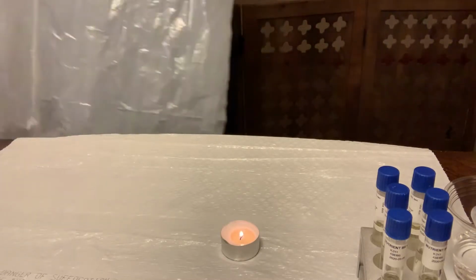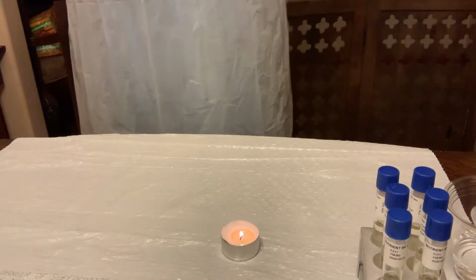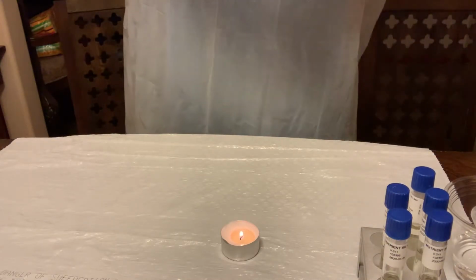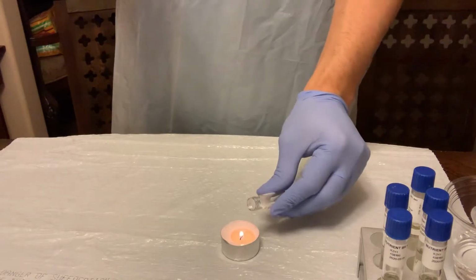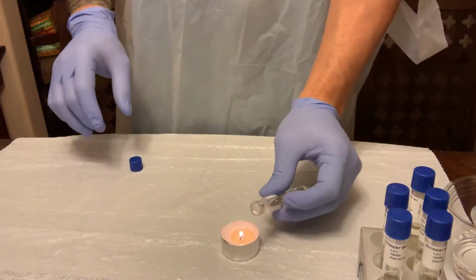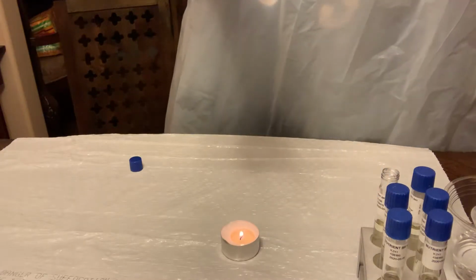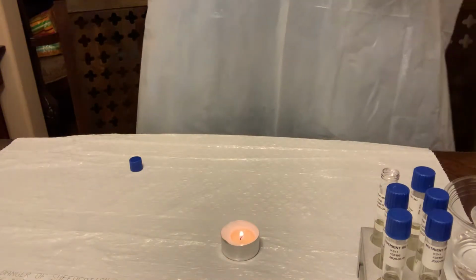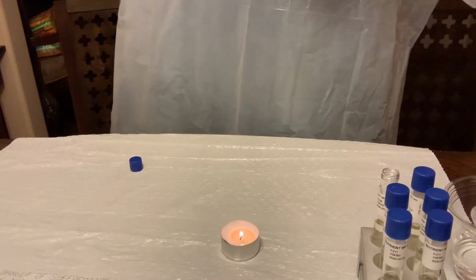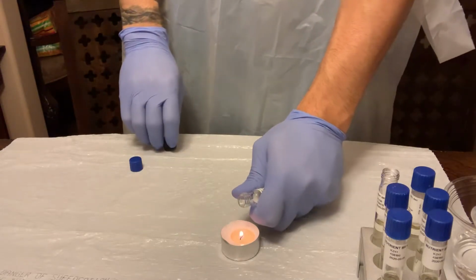For the salt tolerance testing, we're going to start with our S. cerevisiae. Let's start by inoculating our 1% NaCl. Open this up, run it over the flame, and inoculate it like we all know how to do. Stick it there. Let's inoculate our S. cerevisiae like we all know how to do. Stick that there.